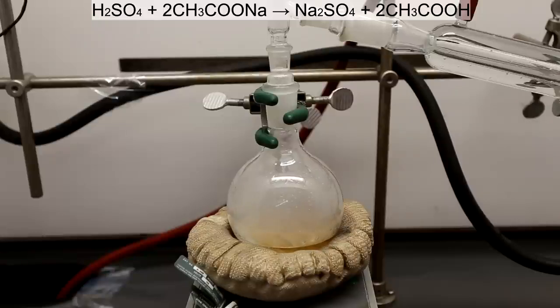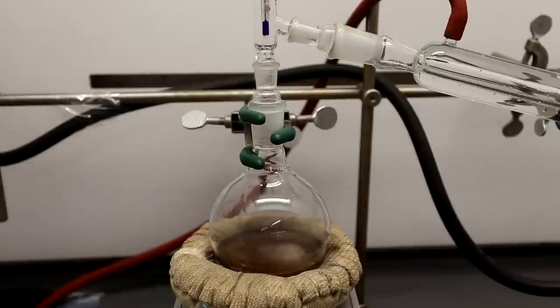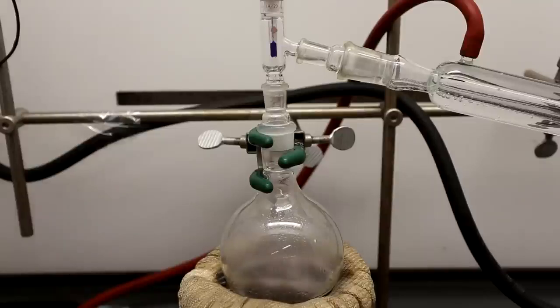to distill it off. The addition funnel was removed and replaced with a thermometer, and the solution was brought to a boil. I collected everything that came over after about 115 degrees Celsius. Because the heat source was less than 200 degrees Celsius, the solution stopped boiling once all the glacial acetic acid had been distilled off. What remains in the flask is excess sulfuric acid and sodium sulfate salt, which both have a very high boiling point.